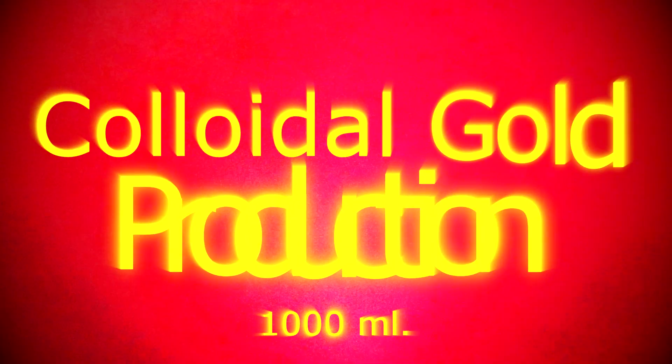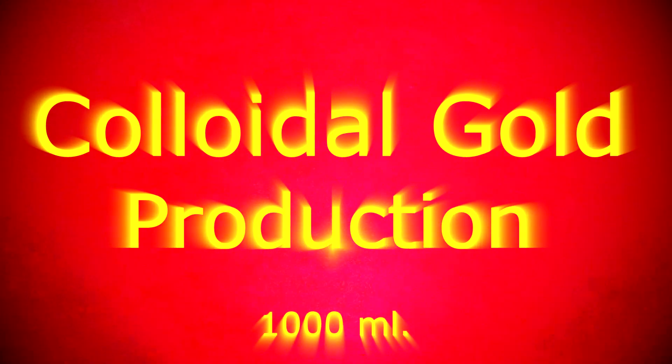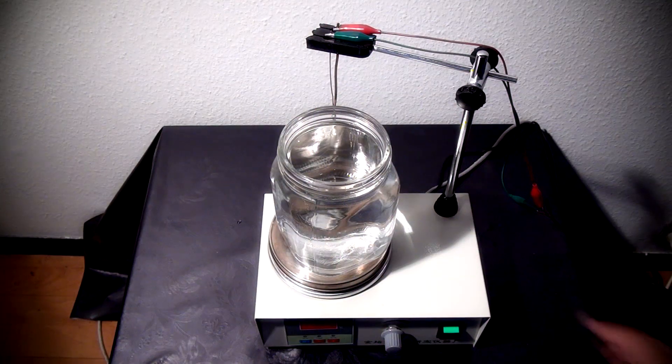The next three minutes, you can see how to make your own colloidal gold and how to save a lot of money instead of buying the finished products.